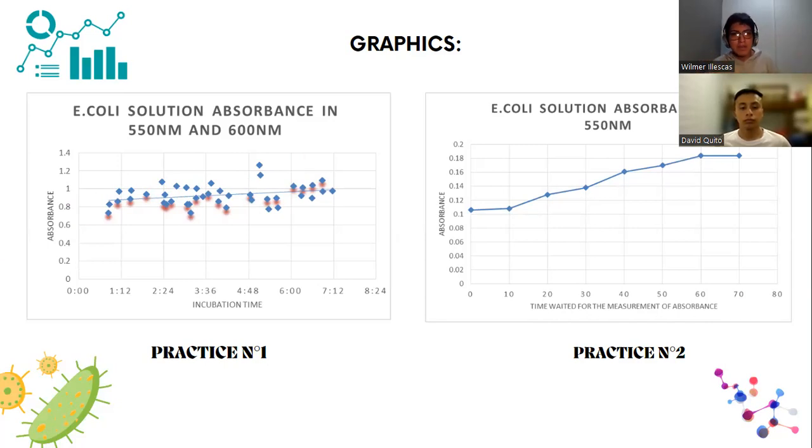And the same happens in 550 nanometers. We started here, it started growing, but then it goes down, it goes even much down again, up, down, and then it goes up again. So this is not so coherent.